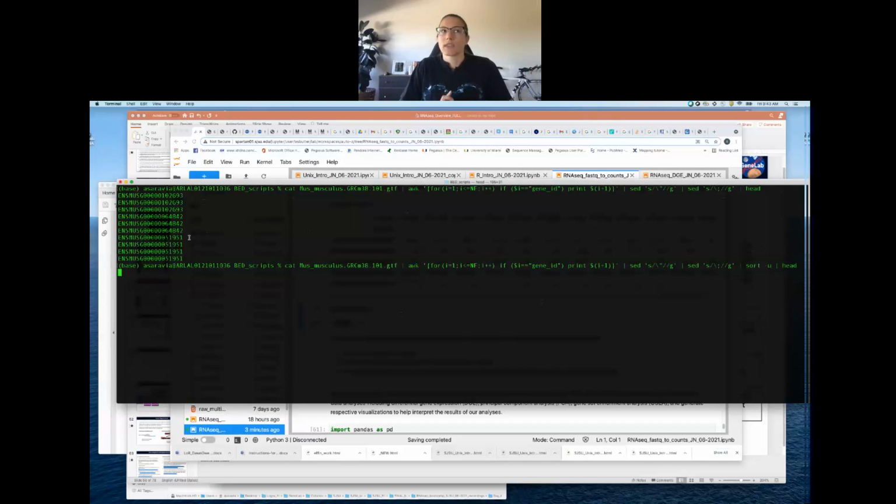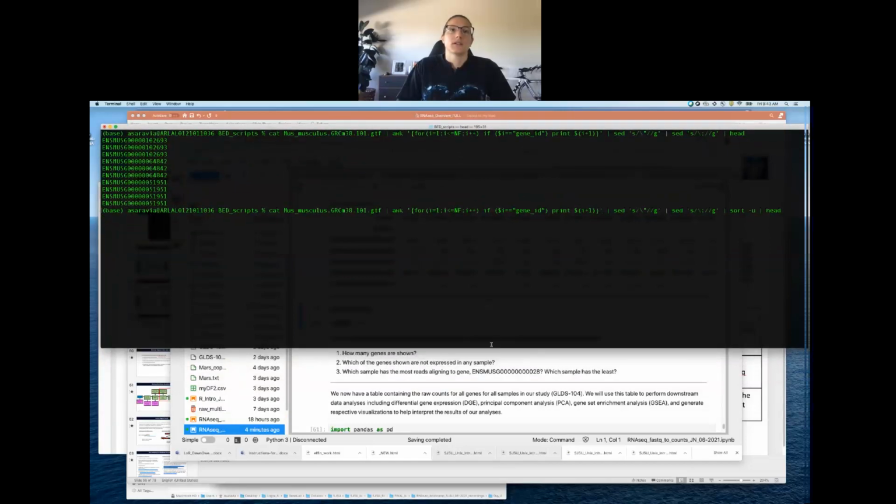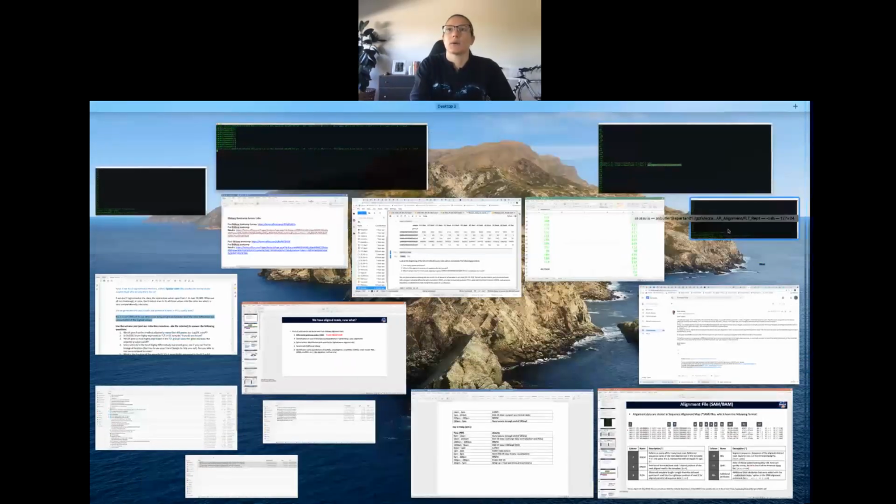You'll do that eventually. Probably should have cleared my screen. That's okay. It's because it's sorting through 2 million lines. What you're going to see at the output of this head command is that we now have unique gene IDs. So I'll let that run. This is why I always get impatient and then just start running things from other places.